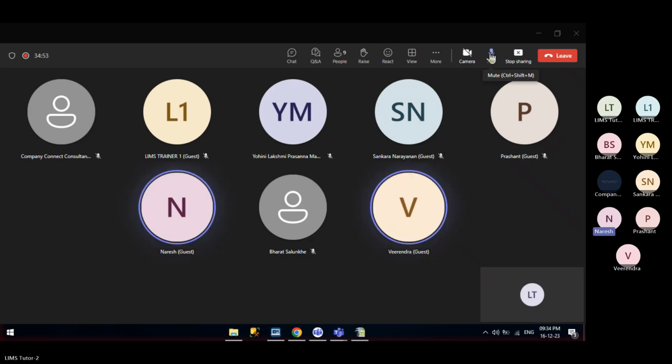Another question: what is Crystal Report? This question is from Naresh and Virendra. Regarding Crystal Report, currently it is not covered, but I did get a query about it. Crystal Report is a third-party application. Currently I don't have it in my system, but I can arrange that.